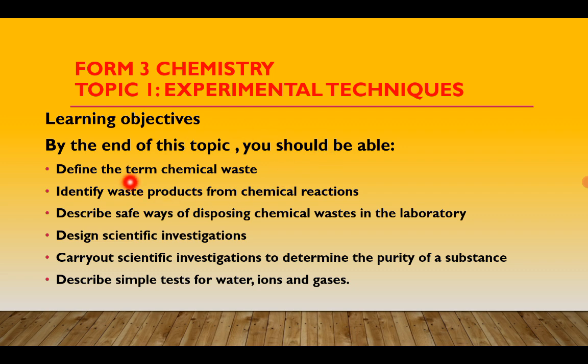So what are we saying? We are saying that to show that you have truly learned and understood the topic, you are going to define the term chemical waste, identify wastes from chemical reactions, describe safe ways of disposing of chemical wastes in the lab, and design a scientific investigation, as well as carry out scientific investigations to determine the purity of a substance.